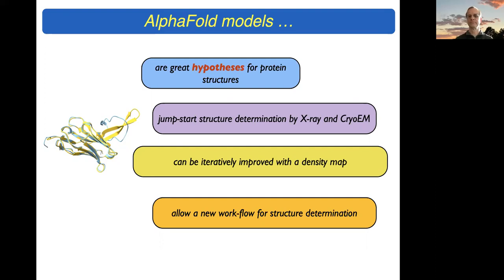Do you have plans to implement multimer modeling within the Phenix Colab notebook? In principle, I haven't done anything with that yet. We're certainly thinking about doing that. I haven't figured out exactly how to proceed with that versus working on making the notebook work more automatically for this rebuilding and iteration of the whole cycle. So we may do that first and then come back to multimers later.